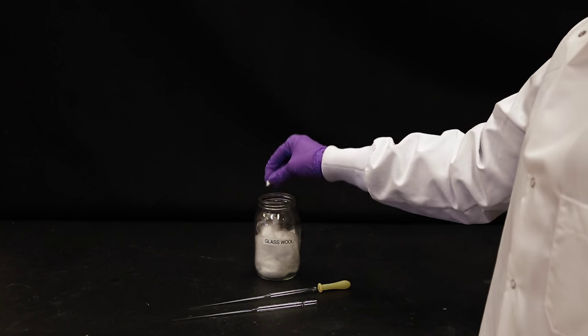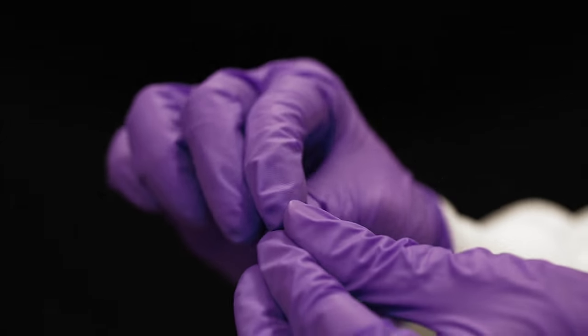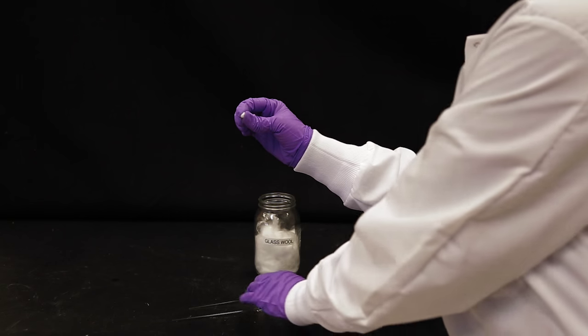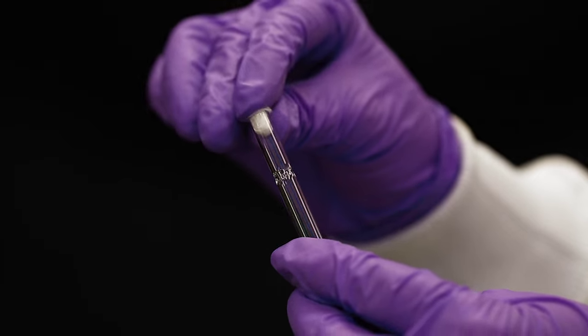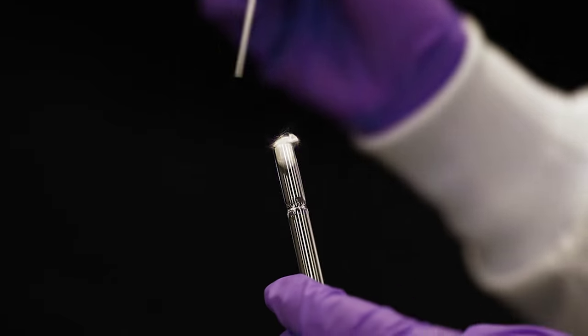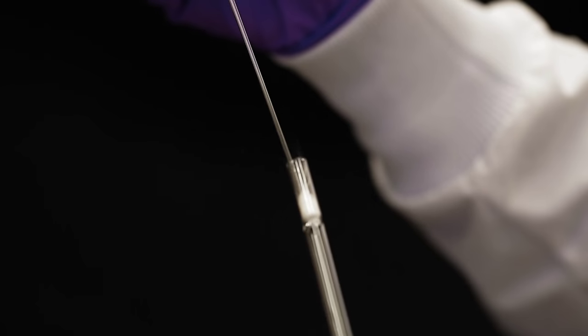Roll a small amount of glass wool into a ball. With the help of the second pipette, push the small ball of glass wool into the Pasteur pipette all the way to the narrower point in the pipette.